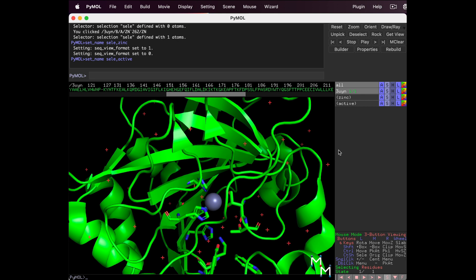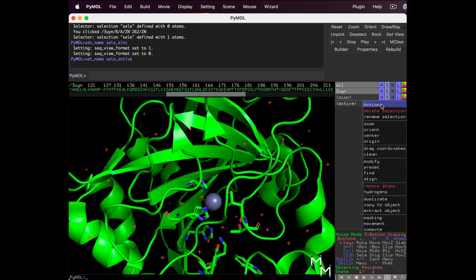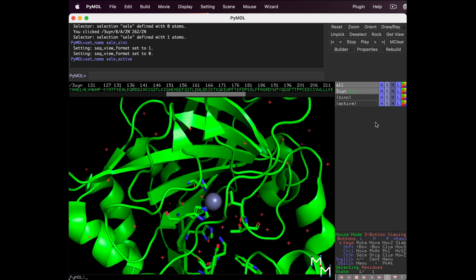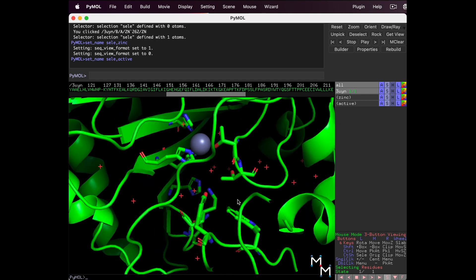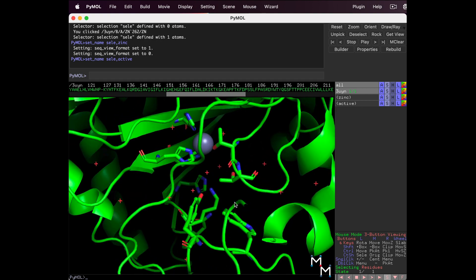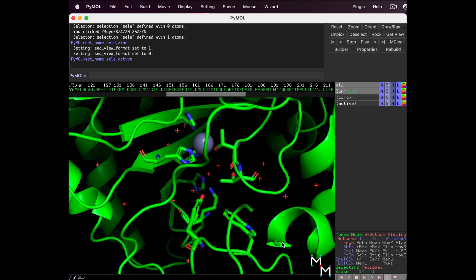Let's zoom in on the Active Site. Names panel Active, A, Zoom. Notice how parts of the structure fade. Some clipping has been applied. Check out video 1 for a description of clipping and how to adjust it.